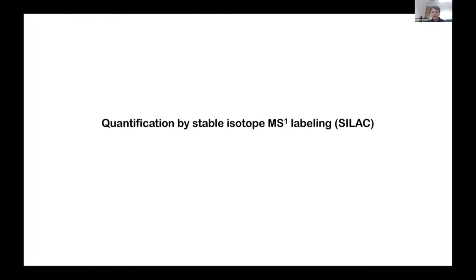Now, moving on to specific strategies used for quantification in proteomics. Quantification really is the concept that we don't just want to identify the proteins that are present in a sample, but we want to be able to do quantitative comparisons across a set of samples.